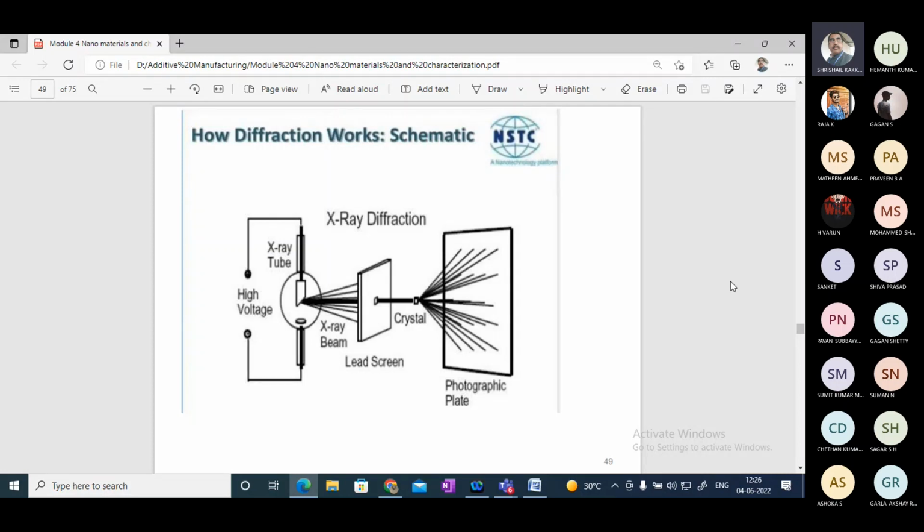There are also flexible possibilities to find out the diameter or the shape of the element, what the distance between these elements is, and whether any foreign materials are there. All those we can find out. Just like we do an indentation test, once after the indentation, we can find out the depth of indentation, the diameter of indentation, the cone size, and all this. In a similar way, here it is possible to find out all this information.